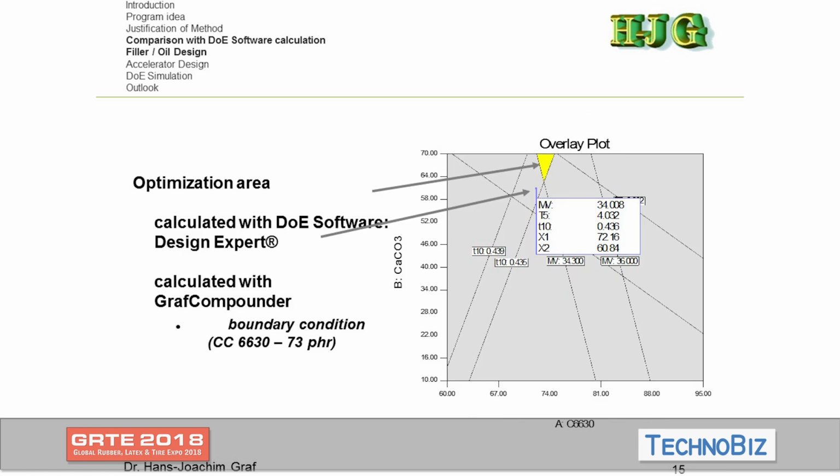So we are significant, and now I try to predict this with this set of data with the tool, and then you see that is the optimization calculation from the statistic experimental time, the software, and here you see that is the unsmoothed data actually from the compounding software and the values there, and you see that it's very close. Actually, that's all inside the measurement error.